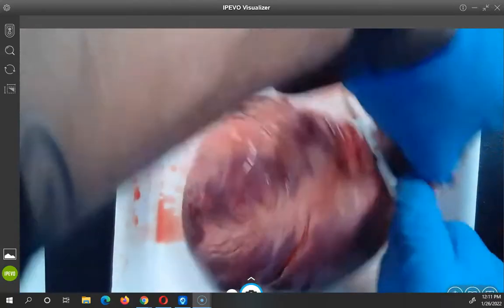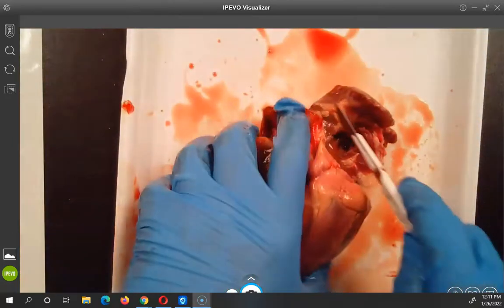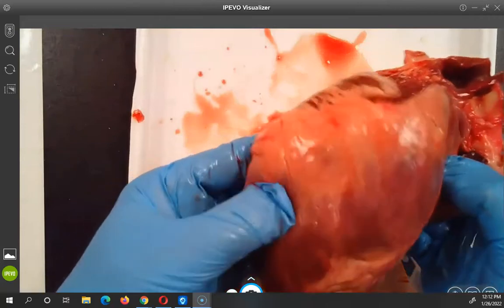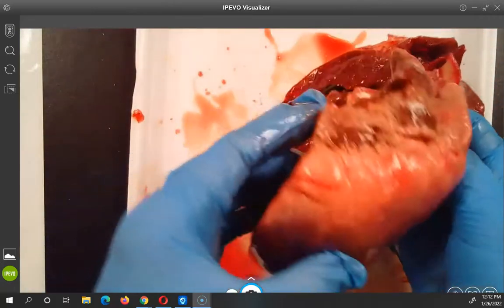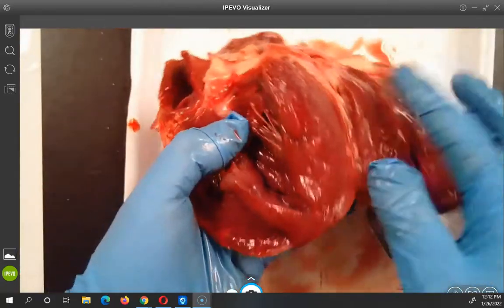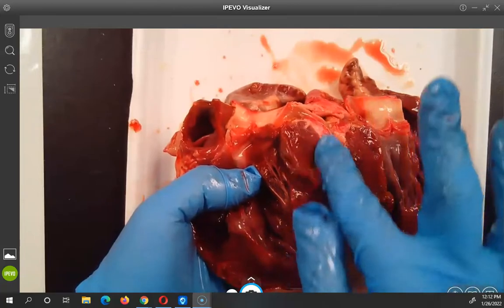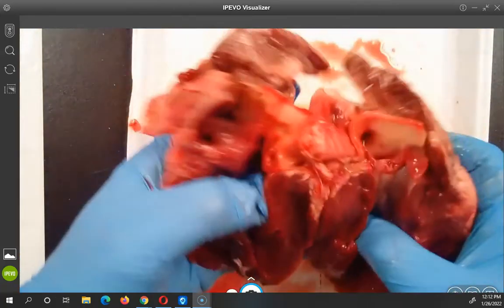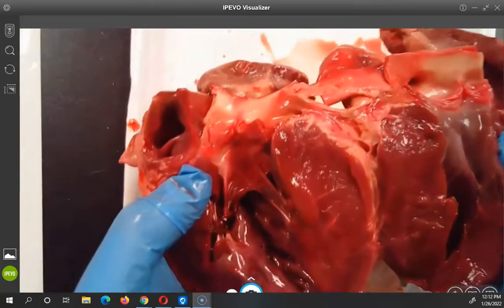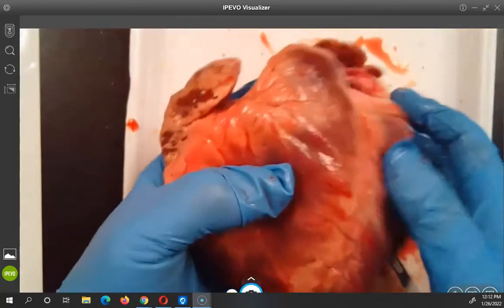You can ask your parents to buy you one at the butcher. It's not that squishy — it's kind of hard. Well, it's a muscle and it's always being used, even when you sleep. You can see how red it is. When you're looking at meat, red is lean; when it's got white going through it, that shows fat. You can see this doesn't have any fat — it's a very lean muscle. That's why people eat it: it's rich, full of protein, and lean. People do eat hearts.